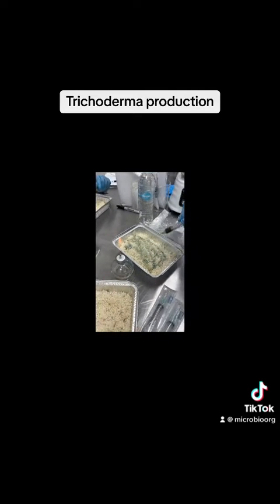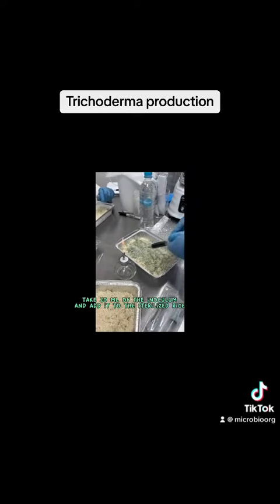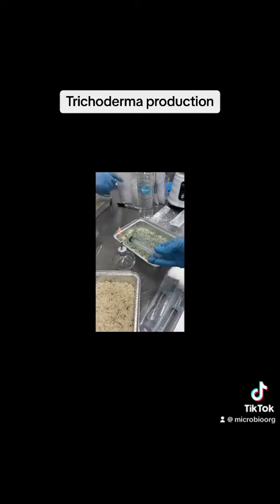Take 20 milliliters of the inoculum and add it to the sterilized rice. Mix the inoculum well with the rice.